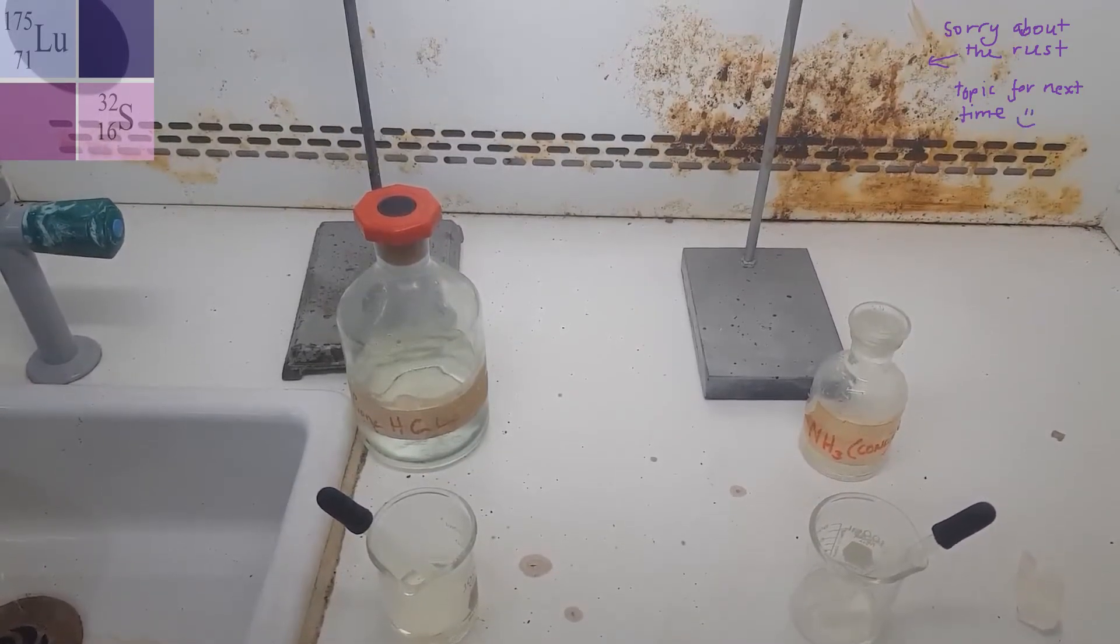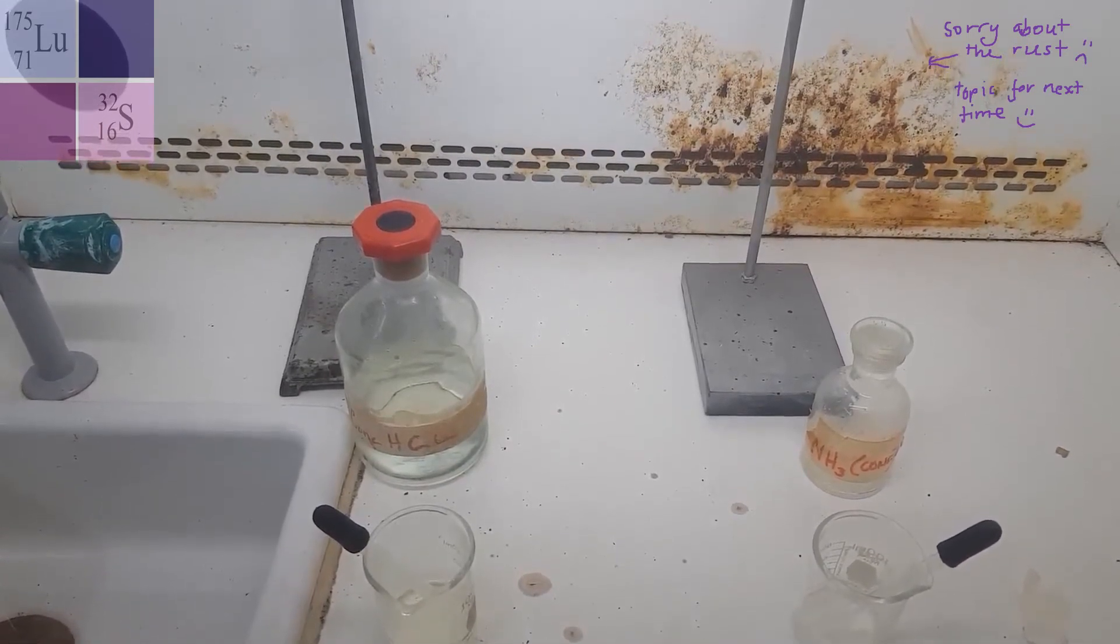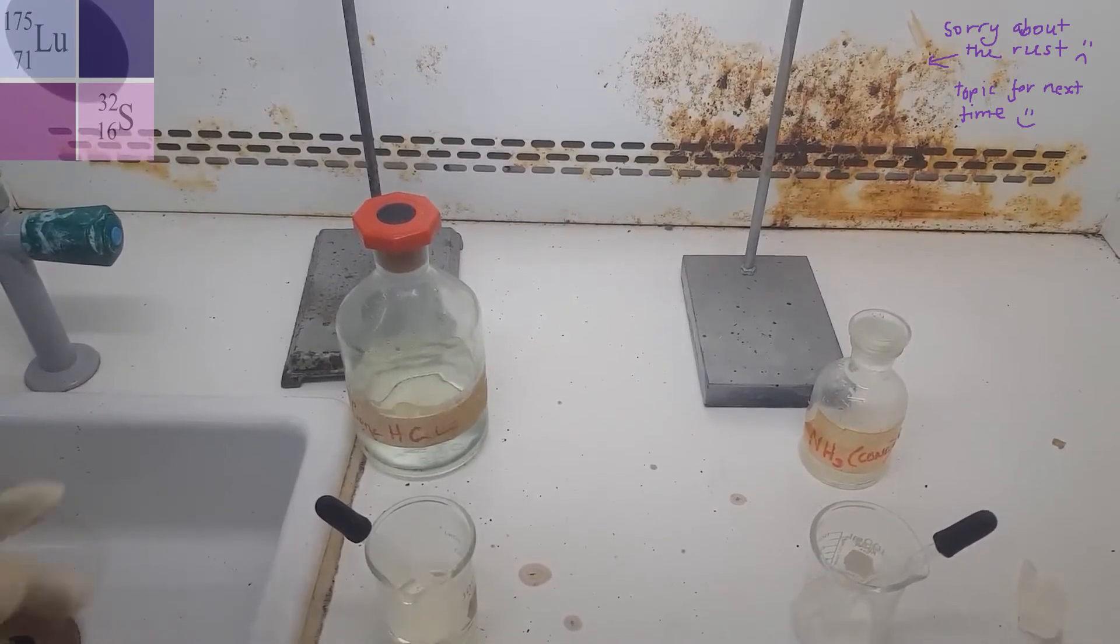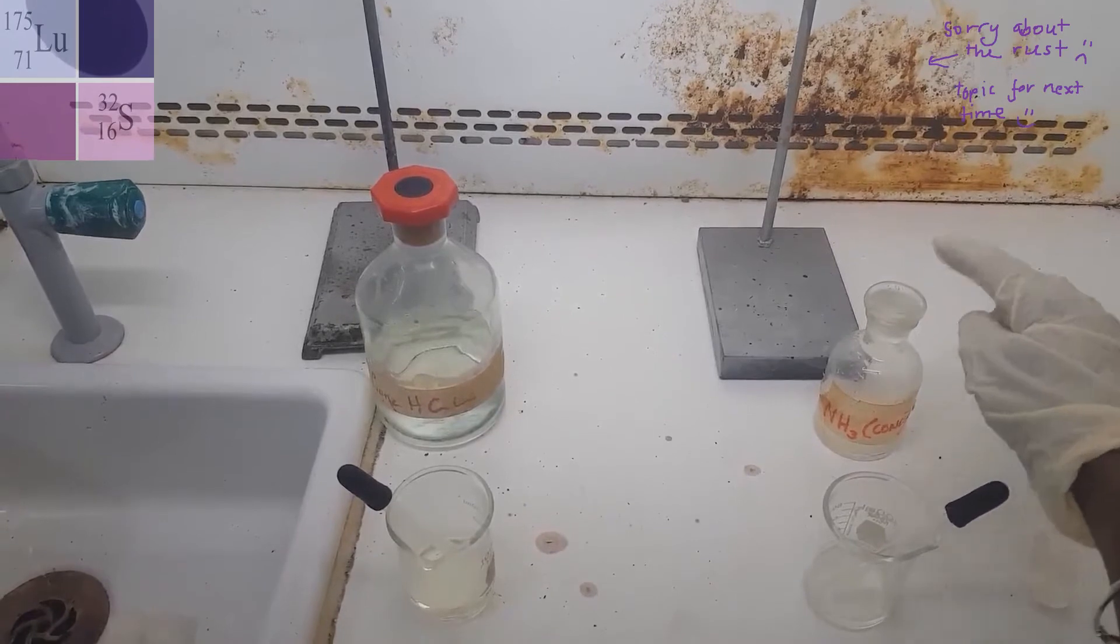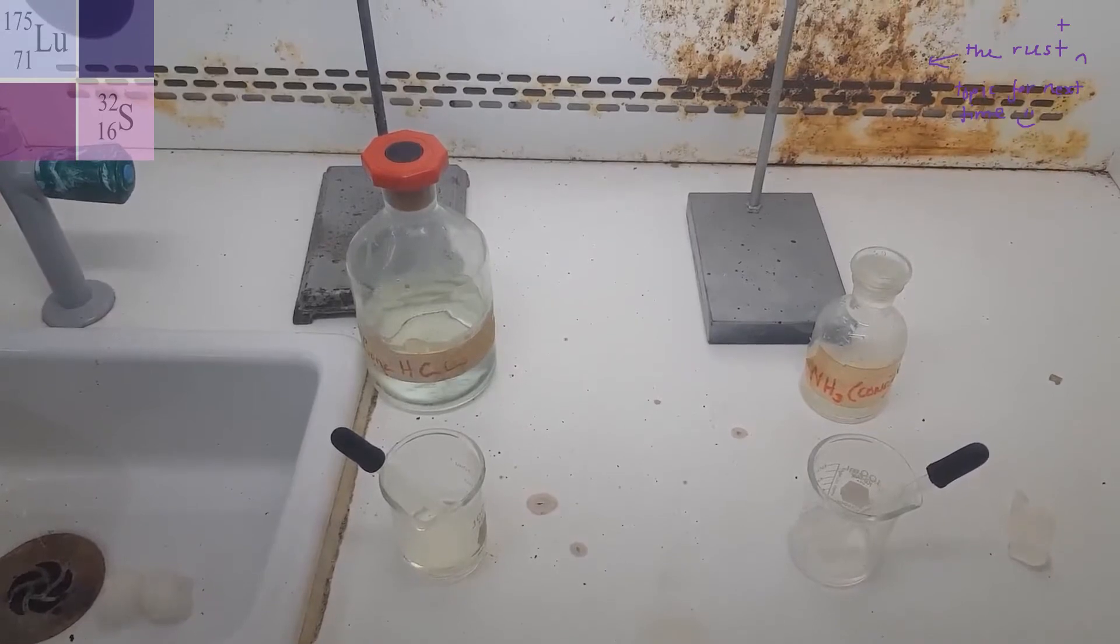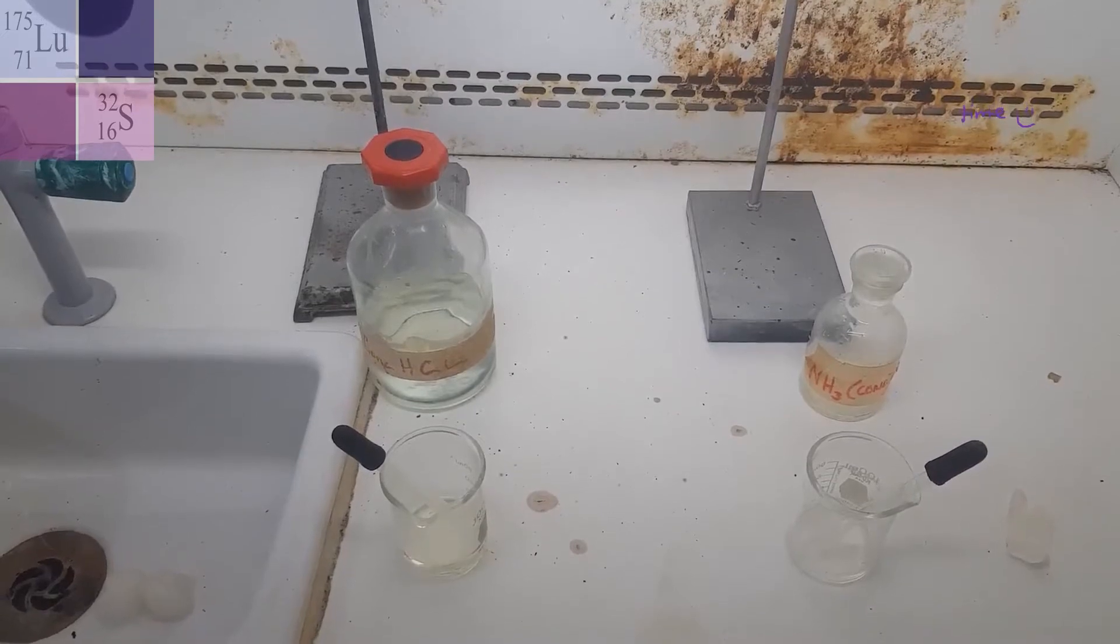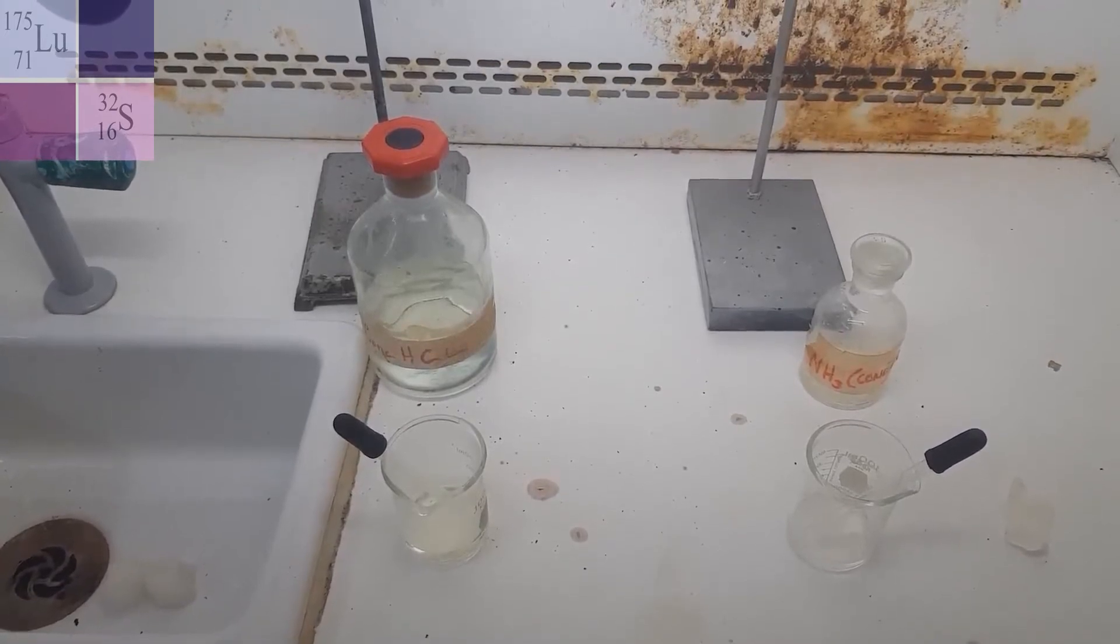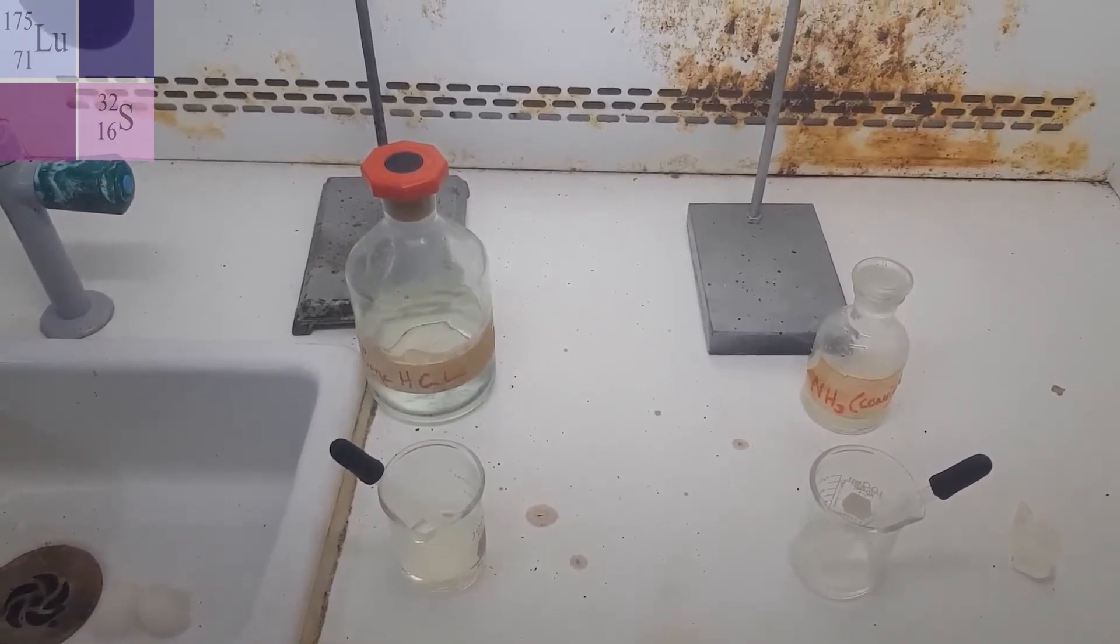So today we're going to investigate the rate of diffusion of gases using two gases, hydrogen chloride gas and ammonia gas. Now in this container here, I have concentrated hydrochloric acid, and in this container, I have concentrated ammonia. So these substances will, as soon as you uncork the bottle, because of their high concentration, they immediately turn into a vapor. So when concentrated hydrochloric acid becomes a vapor, we call it hydrogen chloride gas.